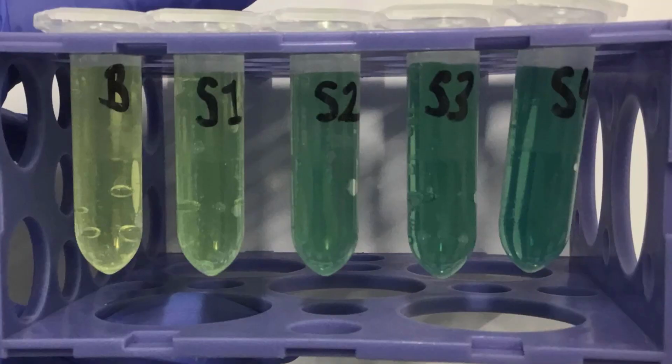Definitely. Once again, it's important that with all of your standards and samples, you make sure that the volume you're putting in is all the same. It's easily checked just by holding them up and looking to see that the same volume has been put into all the samples and standards. And while you're holding it up, you can make sure that the colours of the samples going towards your standard calibration curve nicely change colour, starting with a very light one and going through to a darker colour. Yeah, nice gradient. So here's a picture of what the samples should look like.